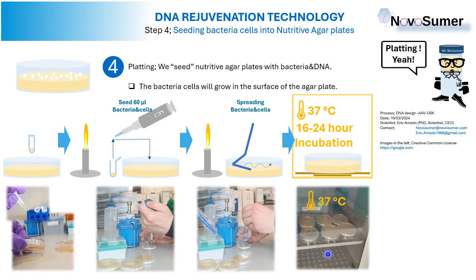Happy? Easy? I hope you are, because the process has finished. After 16 to 24 hours, we will get our results. Let's have a look at the results.